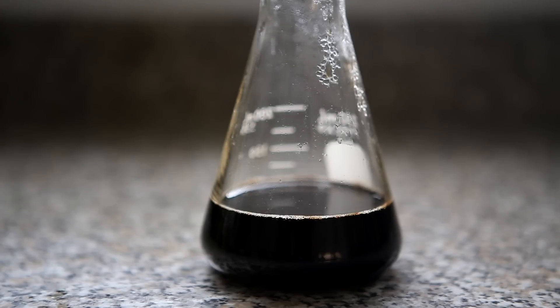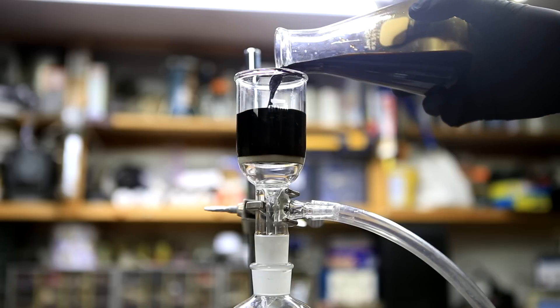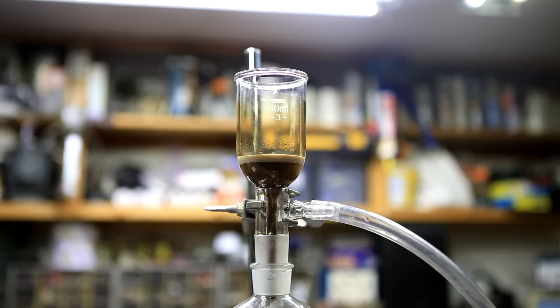The solution was then allowed to stand and cool down to room temperature. This step is optional and probably not required, but I decided to filter the tea extract prior to the separation process. If you choose not to do this, you can transfer it directly to a separatory funnel.